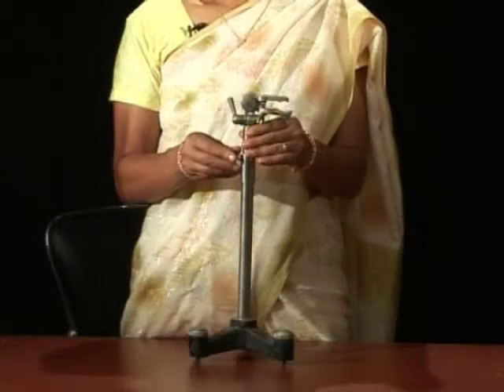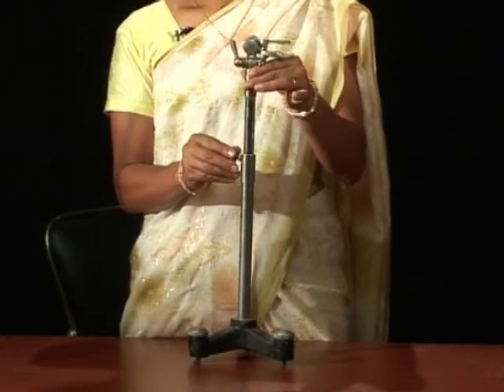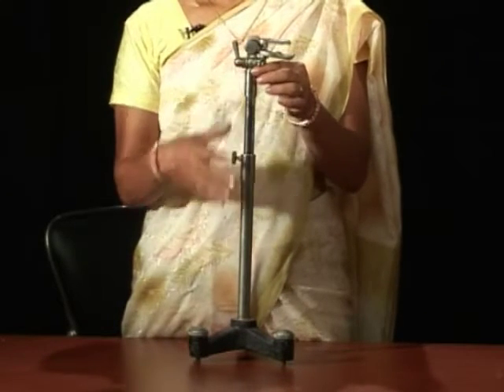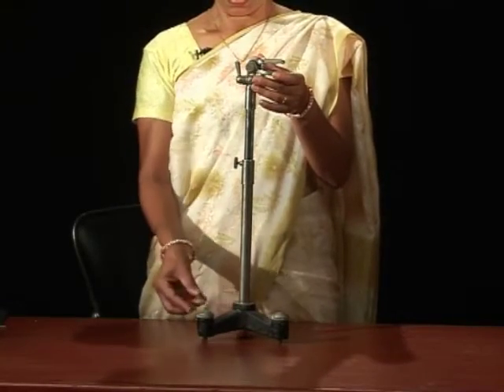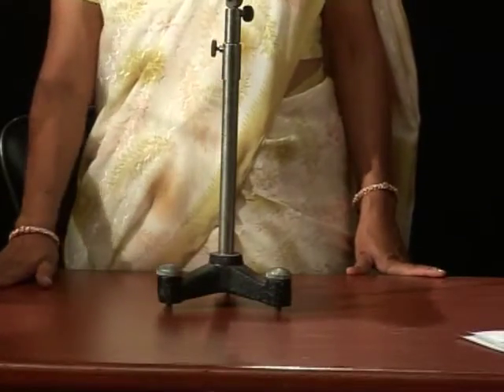Here, the purpose of having a long hollow tube whereby it can slide up and down or in and out of another metal tube is meant for adjusting the height of the tubular craniophore as per the requirement. So also, the screws provided at the tripod base is meant for adjustment to a required level.